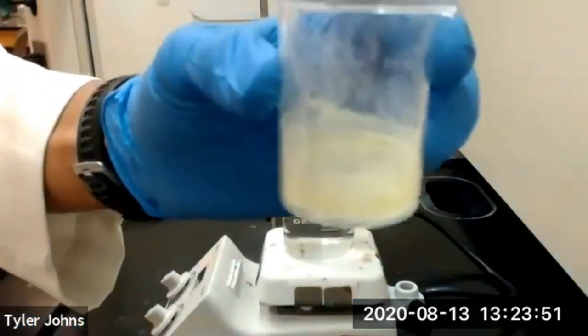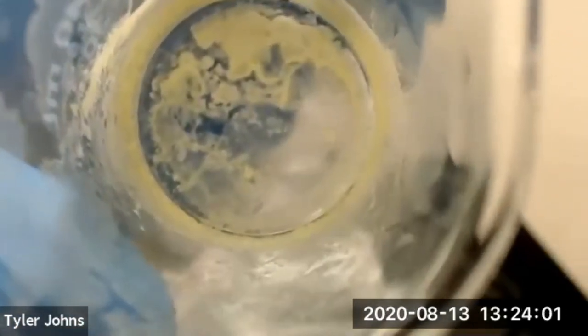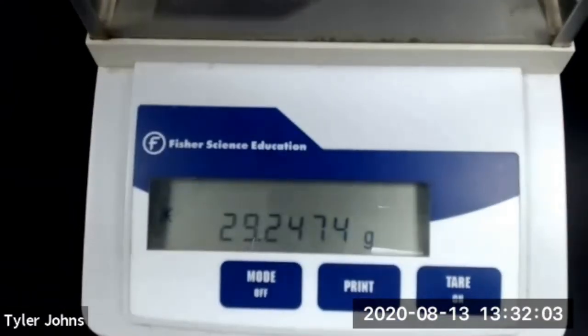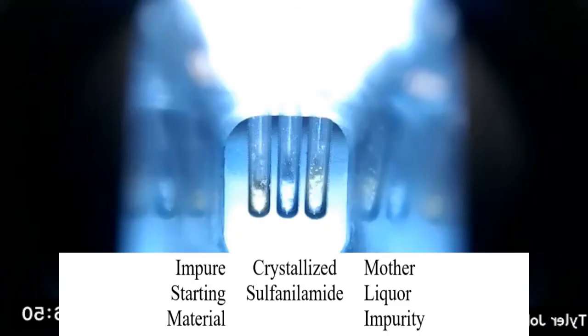We've completely evaporated the 95% ethanol from our pre-weighed 50-milliliter beaker, so we'll now determine the mass of the solid inside. The mass of our pre-weighed beaker plus the solid is 29.2474 grams. The difference between the mass of our pre-weighed beaker and the beaker plus the solid is the mass of our impurity, which is fluoranone. We will now determine the melting points for our impure sulfanilamide starting material, our purified sulfanilamide, and the impurity recovered from the mother liquor.